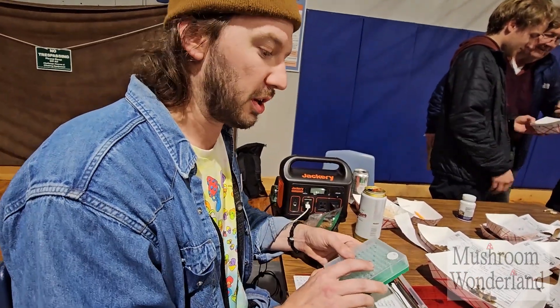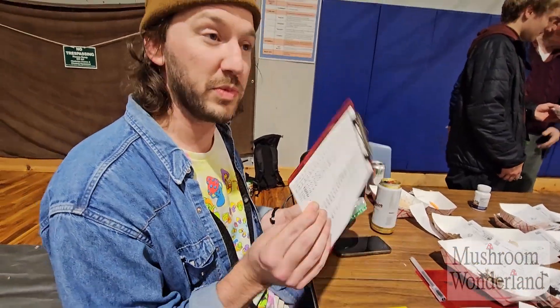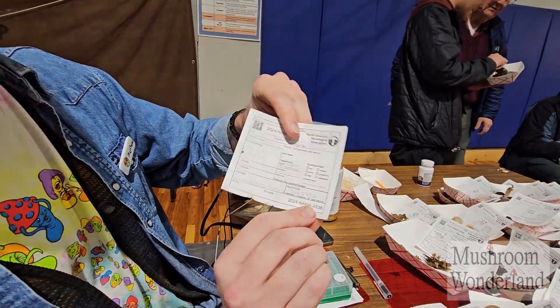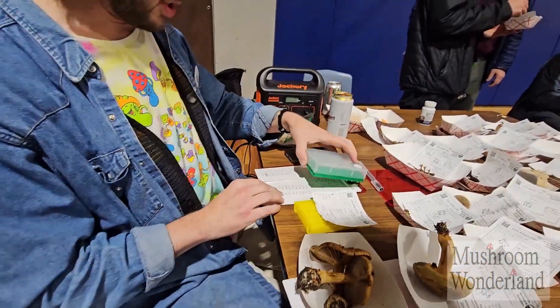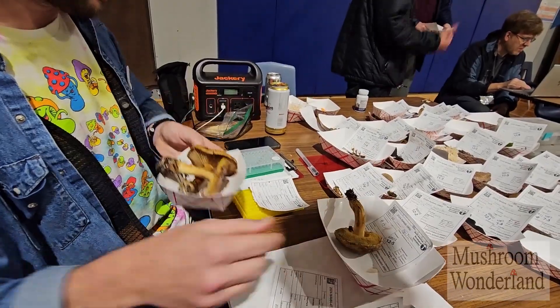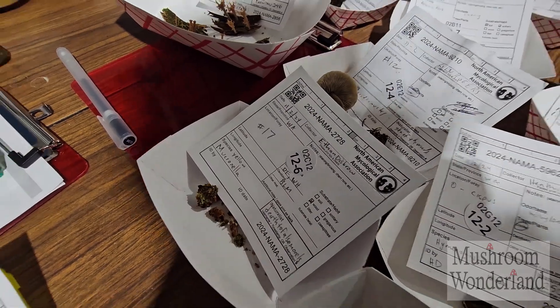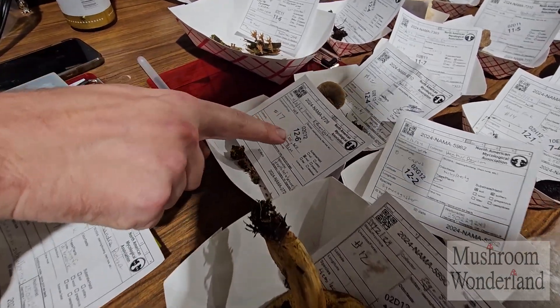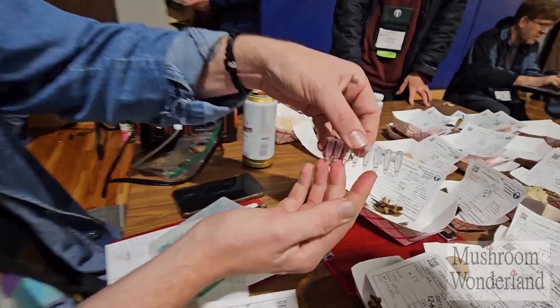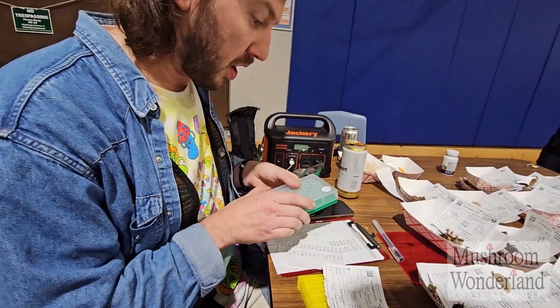They're keeping track of each one — there are 96 per plate, meticulously noted with the voucher number. Hart's made these stickers, and Steven has been putting them on as well. Each sticker has the row number and then the position — for instance, 12-6 means the 6th position in row 12. It's a really straightforward way to track everything.